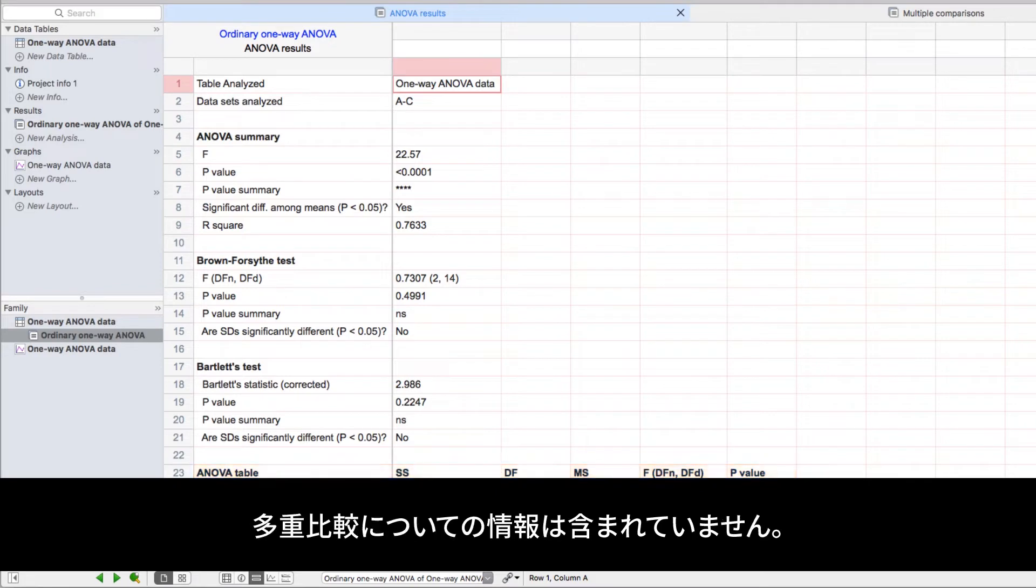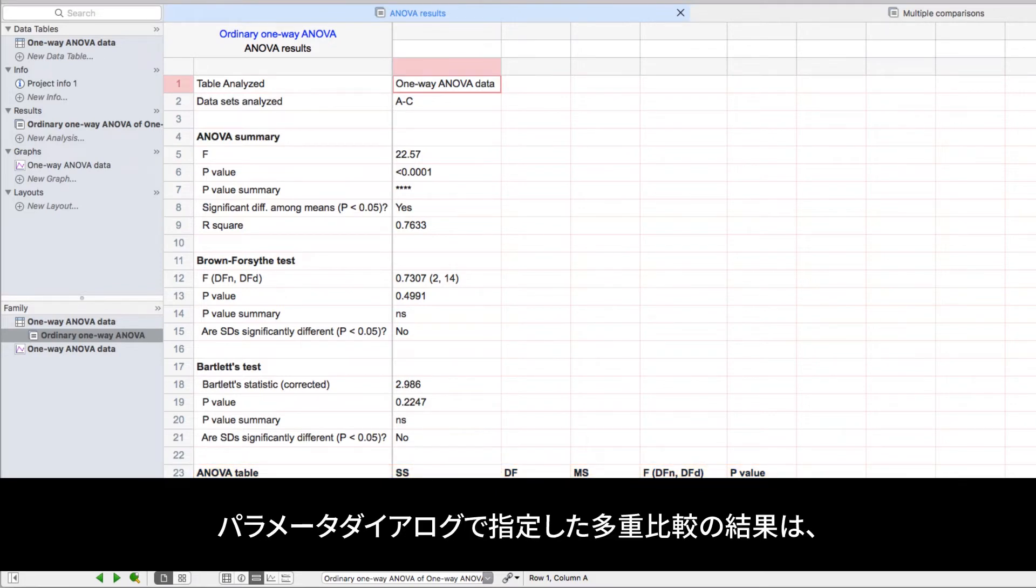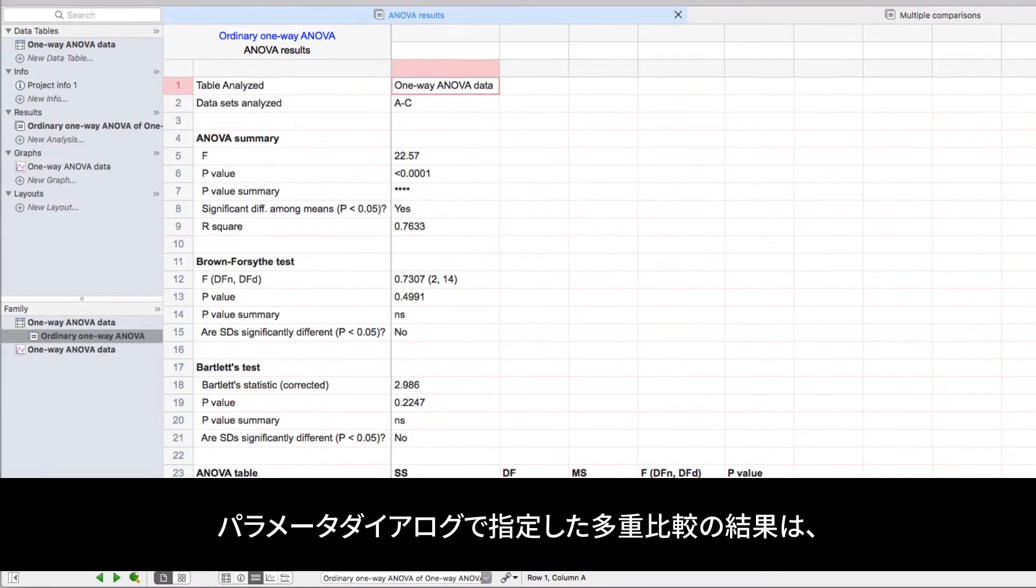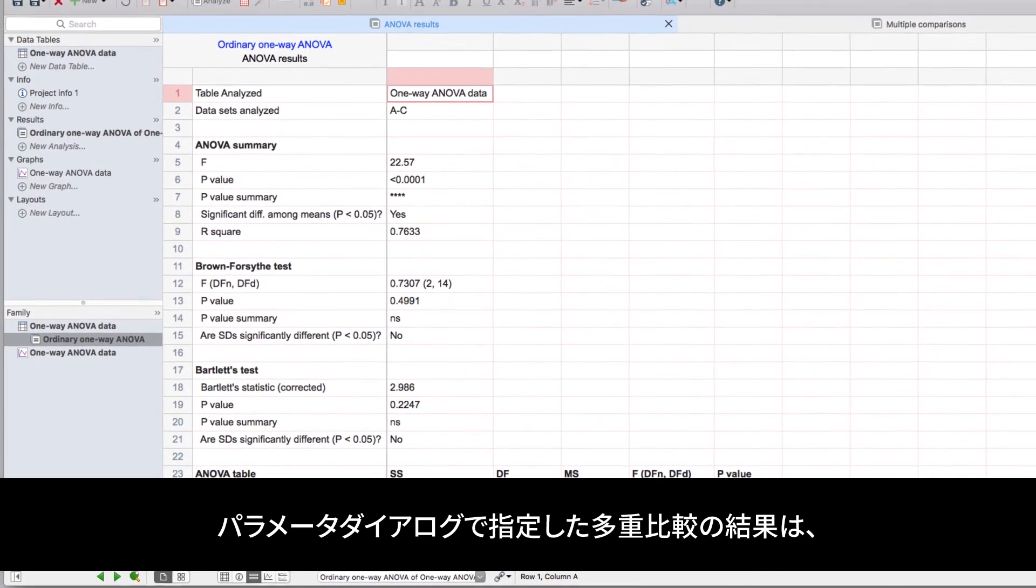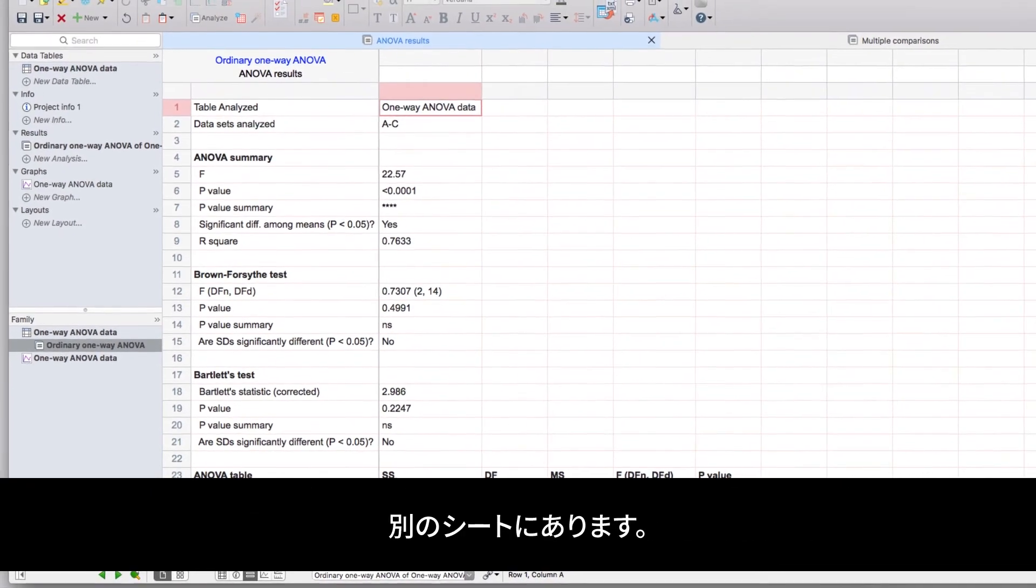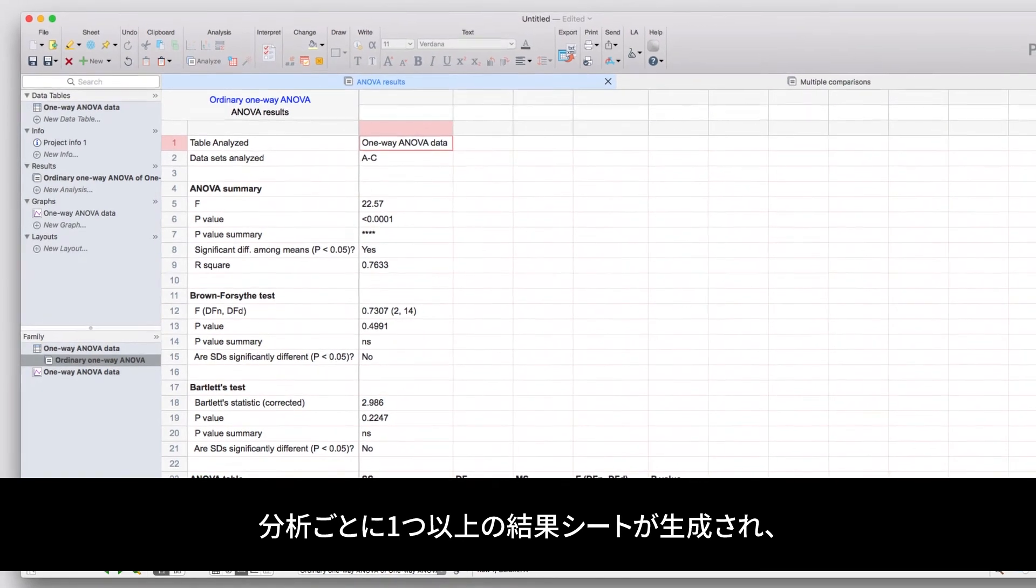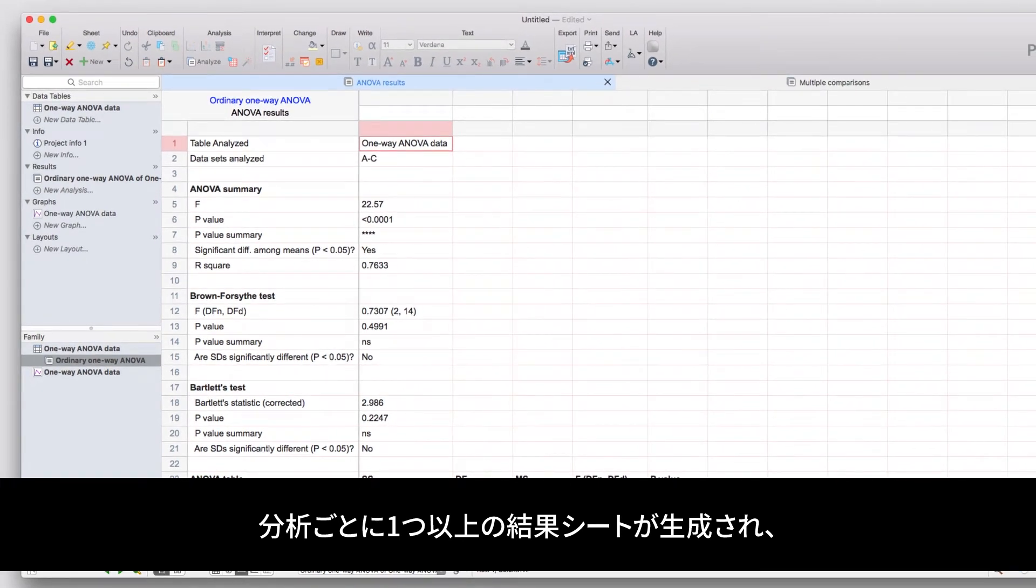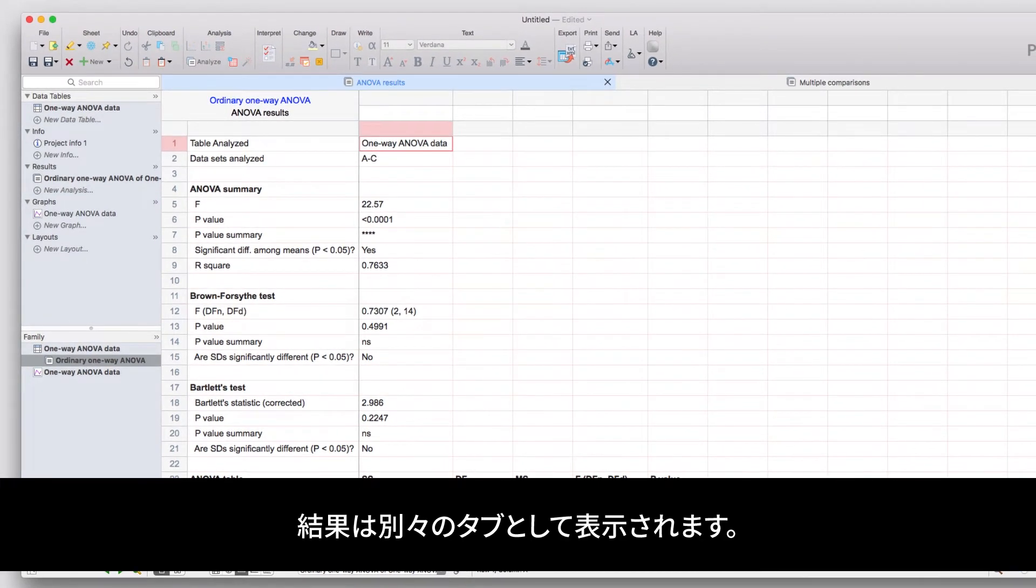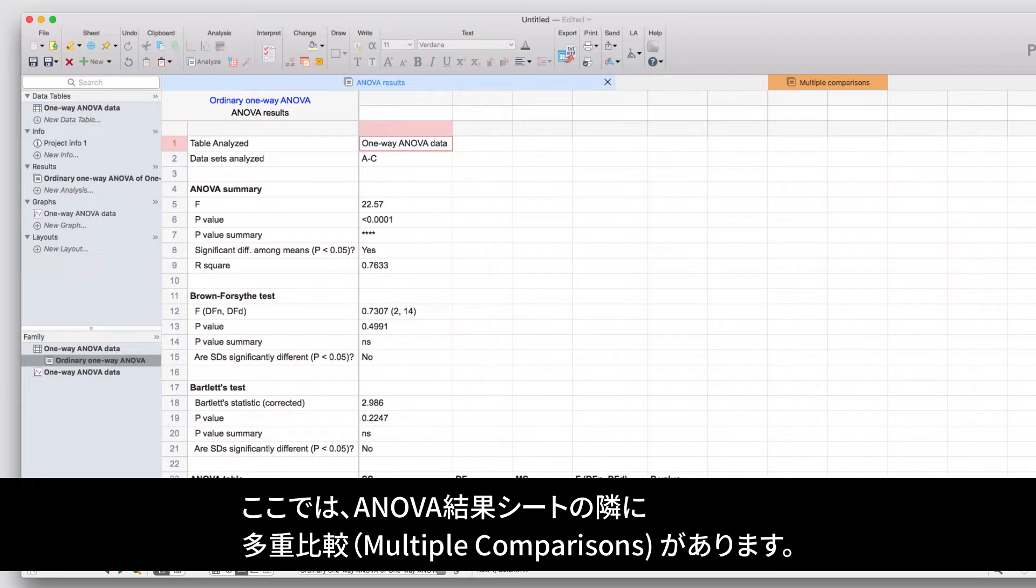However, this sheet doesn't provide the information on the multiple comparisons that we identified in the analysis parameters dialog. Those results are found on a separate sheet. Each analysis that generates more than one sheet of results will display those results as a separate tab. Here you can see the tab for multiple comparisons can be found next to the sheet for ANOVA results.